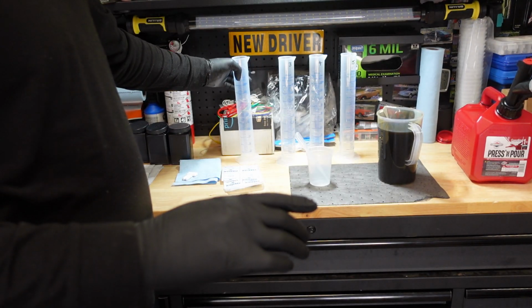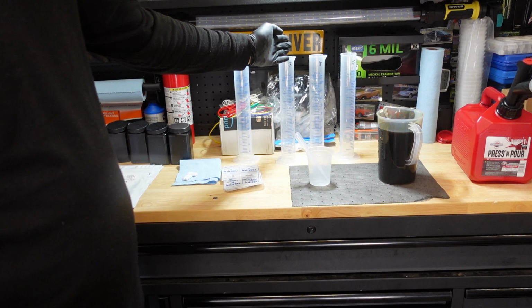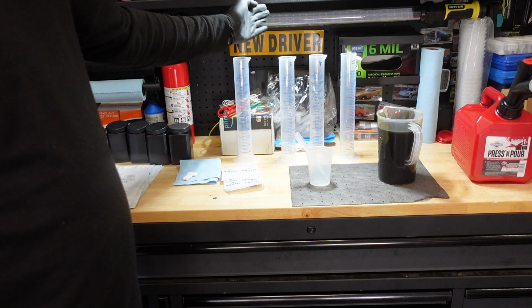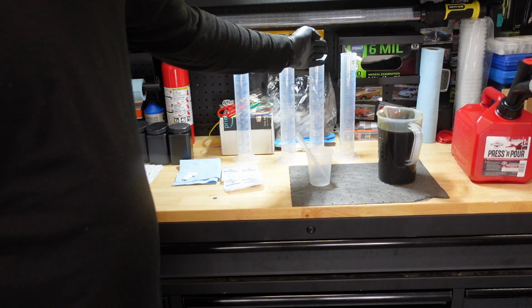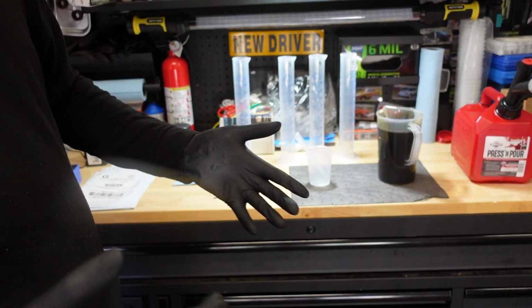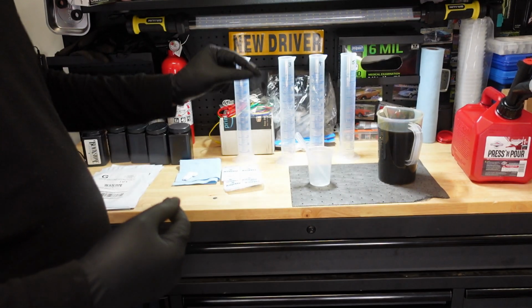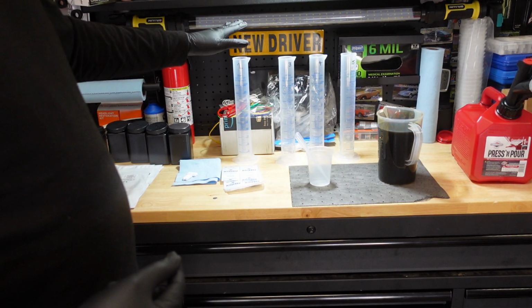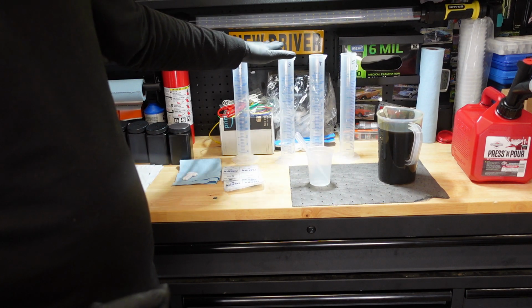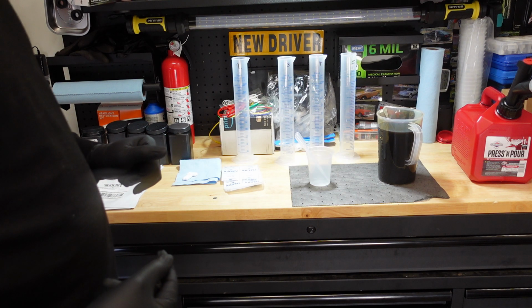If you do dilution or linearity, basically it's all relative. This graduated cylinder will have half of what this one has, this one should have half of what this one has, and this one should have half of what this one had. The values may not necessarily be all that accurate, though they could be. Who knows? That's what we're trying to figure out. But you will have less pronounced error if there's some error in this system with these very inexpensive graduated cylinders.